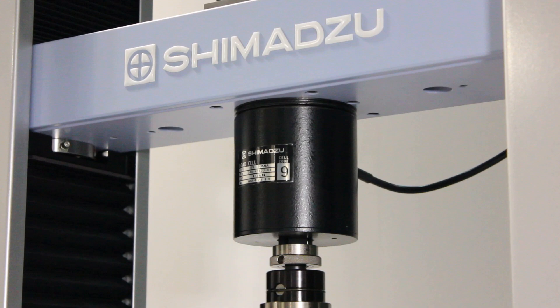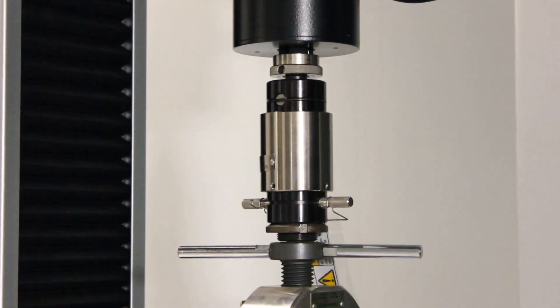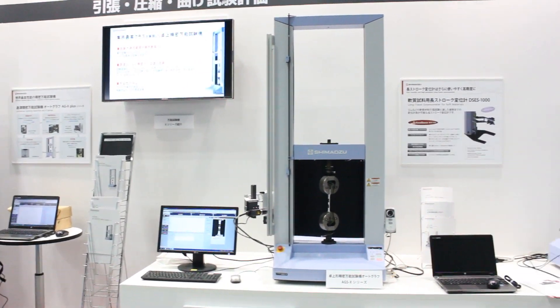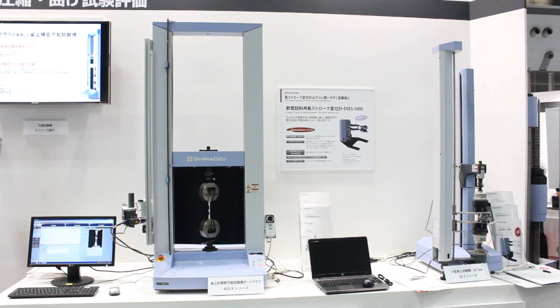Trapezium X software can control not only the AGX Plus series, but also other testing machine series: the AGSX series, the EZX series, and the UHX series.